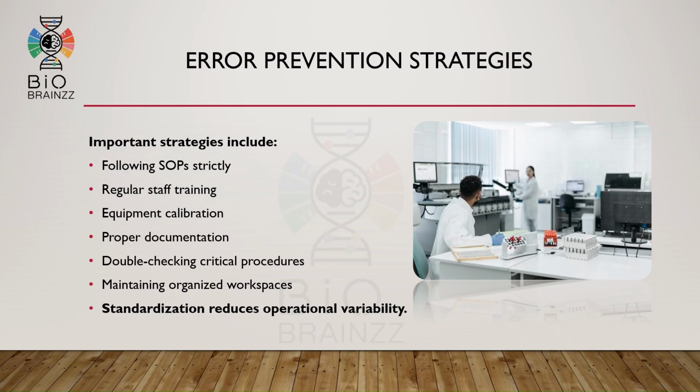Important error prevention strategies include strictly following SOPs, regular staff training, and proper equipment calibration. Accurate documentation and double checking critical procedures are also essential. Maintaining organized laboratory workspaces reduces operational variability and improves efficiency.